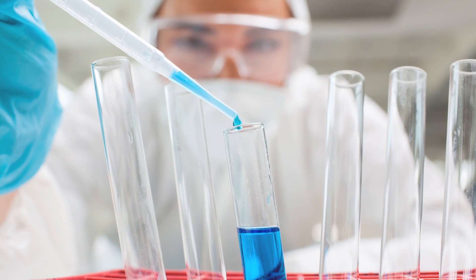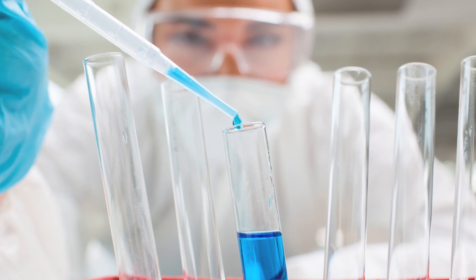The Bruker S2 PicoFox for pharmaceutical analysis is great because it is one of the only instruments that allows us to analyze micrograms of sample rather than the milligrams required by traditional instruments.